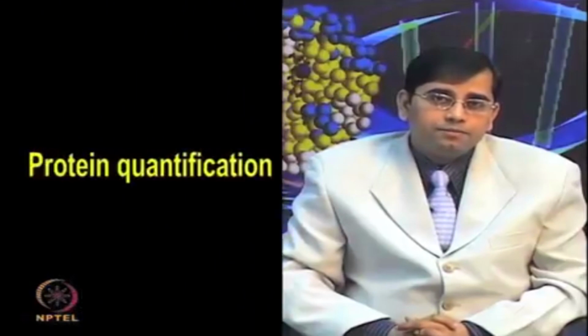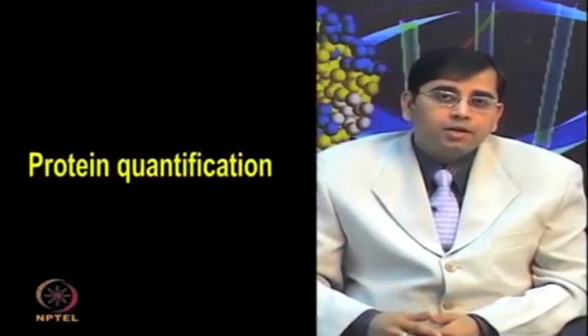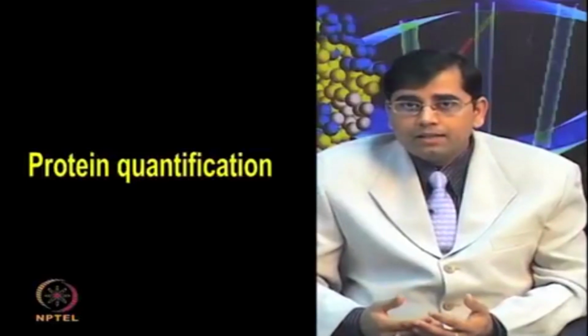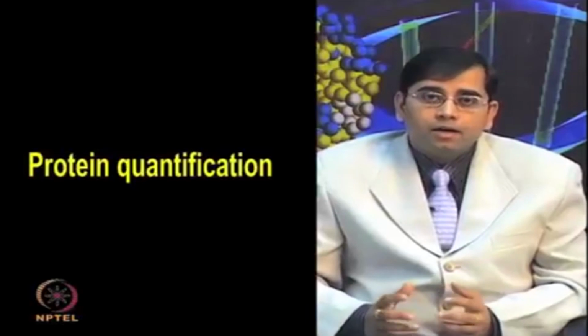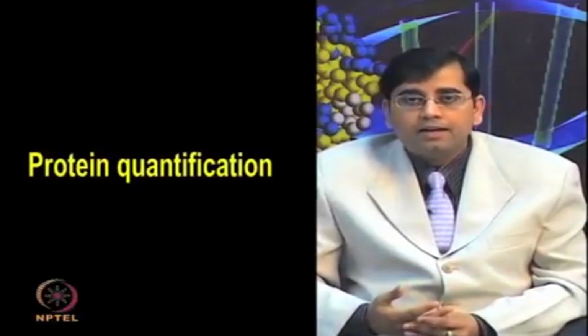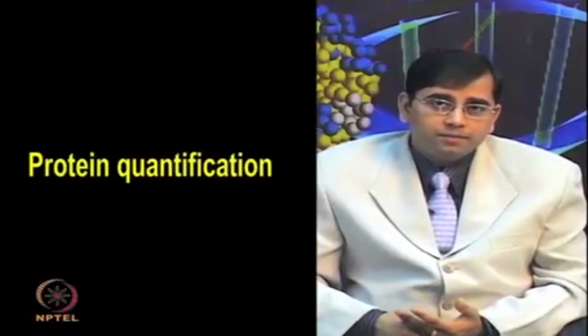So, now let us move on to the next topic, which is protein quantification. By now you have prepared your protein sample by using different types of methods, by keeping a very careful eye on different types of interfering substances and contaminants, and you try to eliminate all of those components.